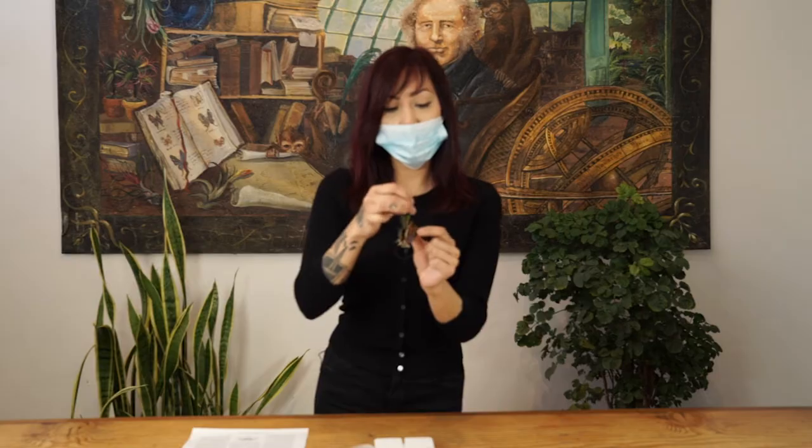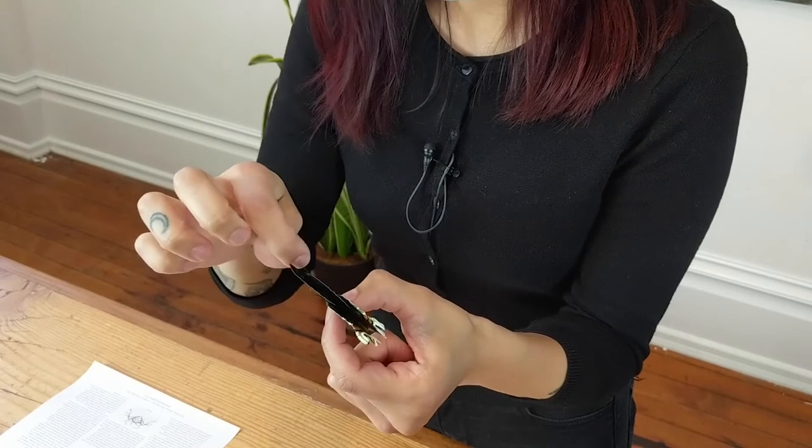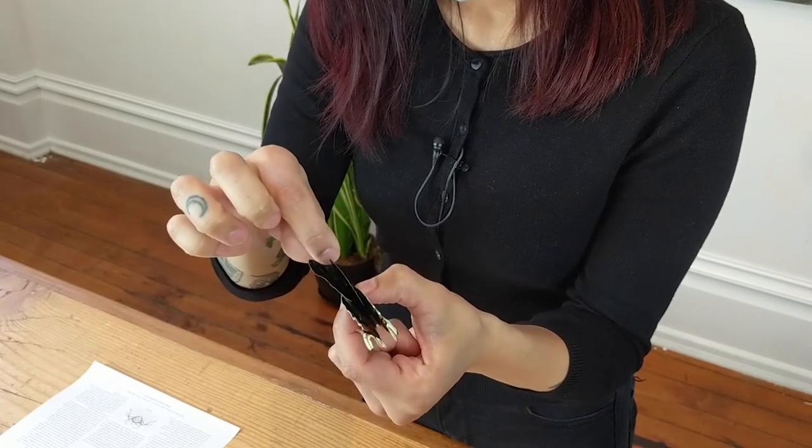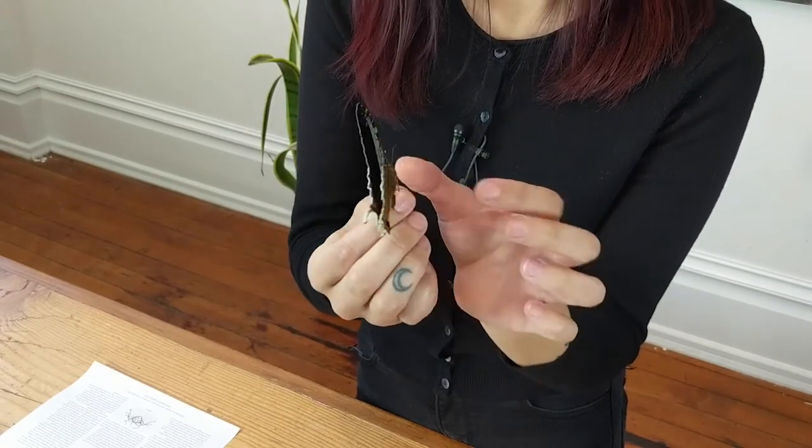Unlike beetles, butterflies and moths are much more fragile, especially their wing area. You will want to get a good grasp on your moth by holding it between your index finger and thumb, right where the middle body region is — that is known as the thorax. You will now take an anchor pin, which is a number three pin supplied in the kit, and insert it straight through its back, right in front where the wings meet.